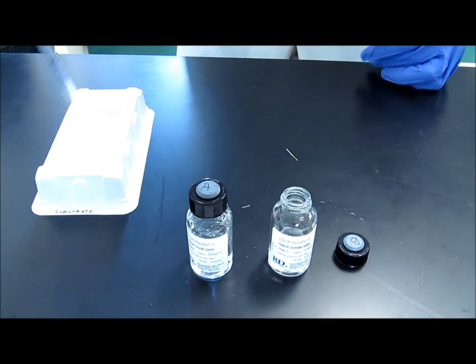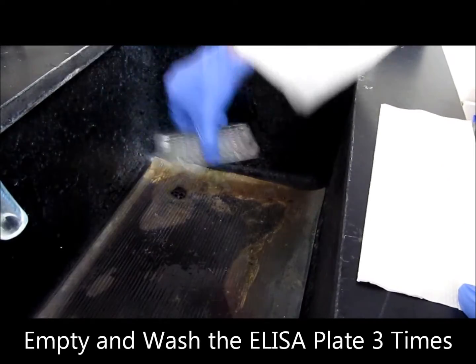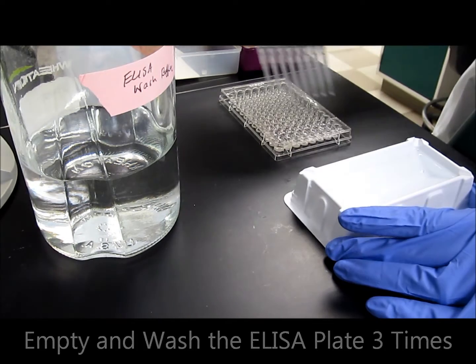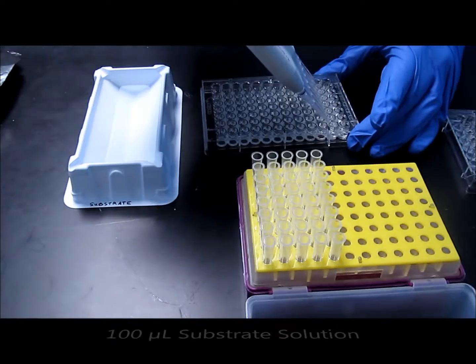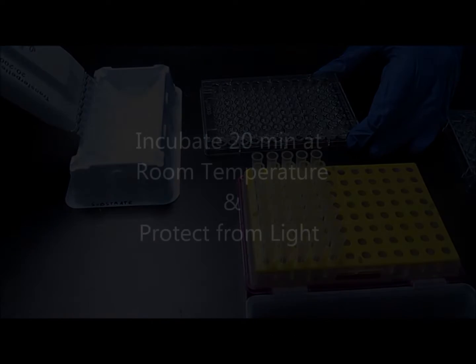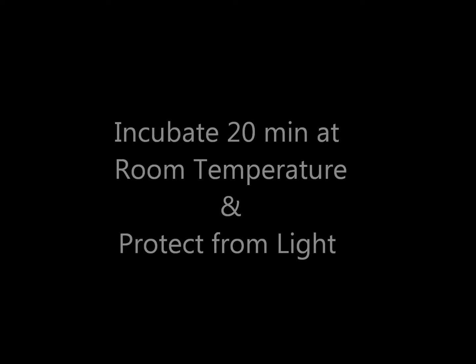Once the 20-minute incubation time is over, wash the ELISA plate three times in order to remove any unbound strep HRP. Add 100 microliters of the substrate solution to each well of the plate. Incubate the plate for 20 minutes at room temperature and protect the plate from light.